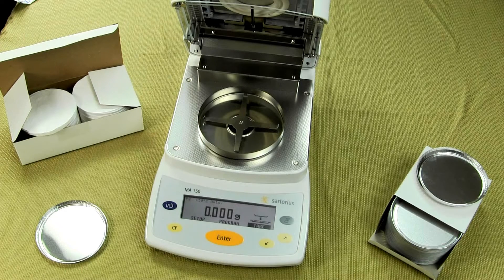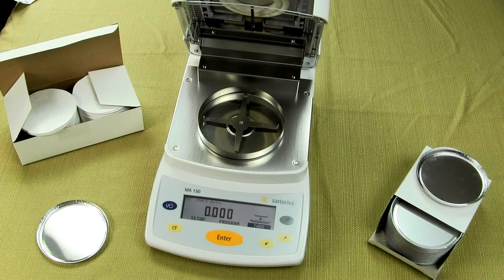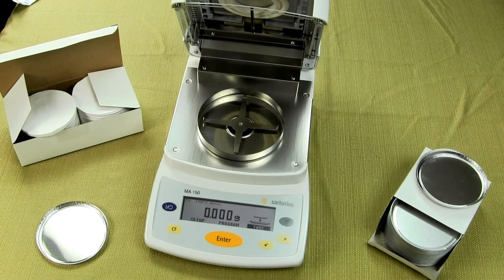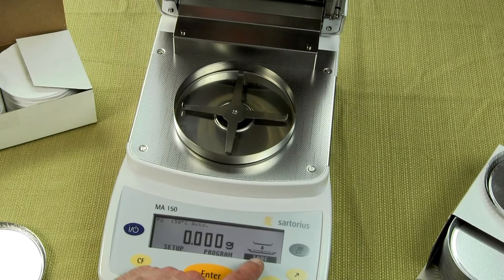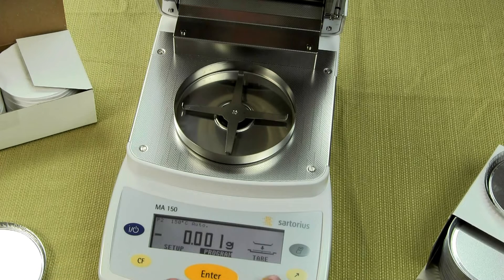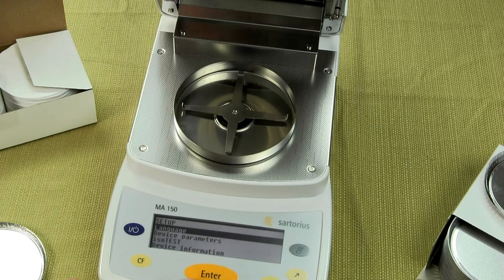Let me show you how to set up a test with this moisture analyzer. It's really simple. The first thing you want to do is select a program, which is extremely easy. You want to go right into the menu. You have the arrows and you'll notice here we have tare, program, and setup. You press the arrow over and go to setup. This particular moisture balance can store up to 20 test parameters.